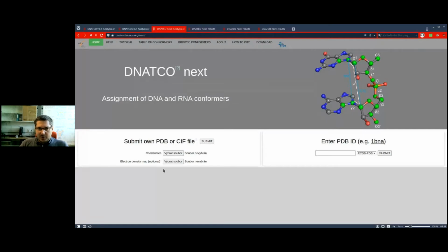These maps are temporarily stored, right now for 7 days, and then deleted, so we don't keep them forever. We keep the original form, and then it's also converted to the format used by the density server, this part of the Mol* package you heard about last week.